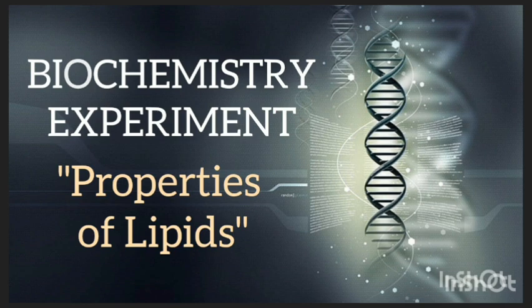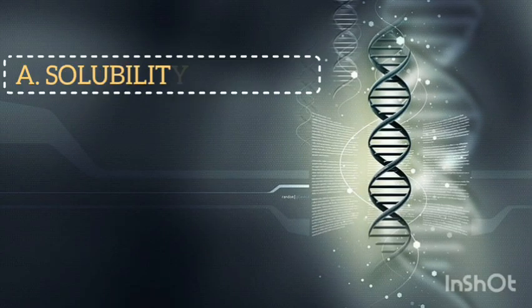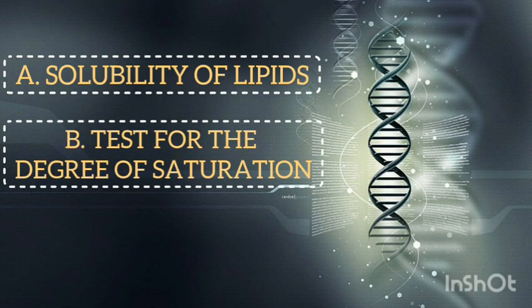Are you excited for our experimentation? Well, our experimentation is divided into two parts. First is to test the solubility of the lipids, and the second part is the test for the degree of saturation.